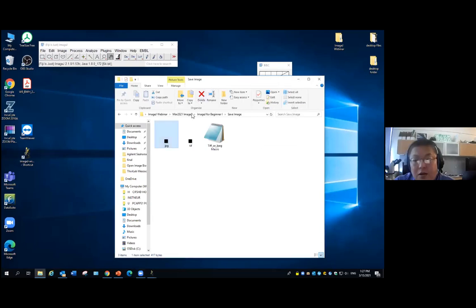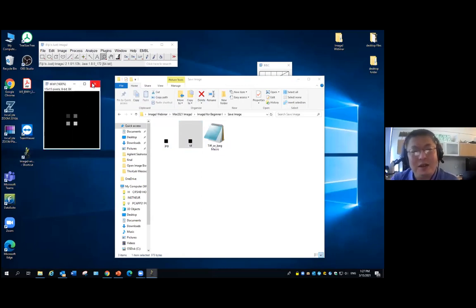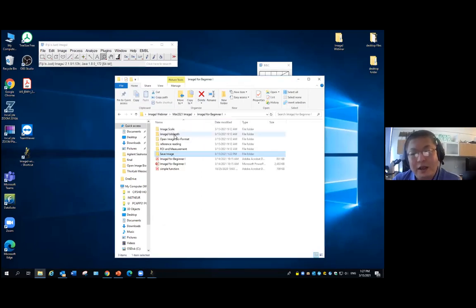Let's go to share the screen. You should be able to drag all the images in. I'm not sure what the setting is on your computer. Sometimes the Mac can be different. But you should be able to for any images.